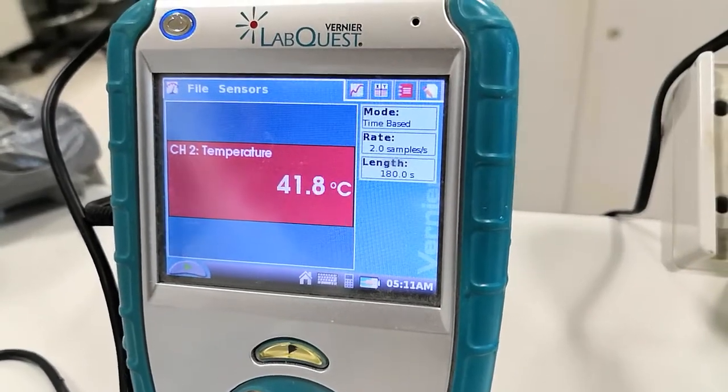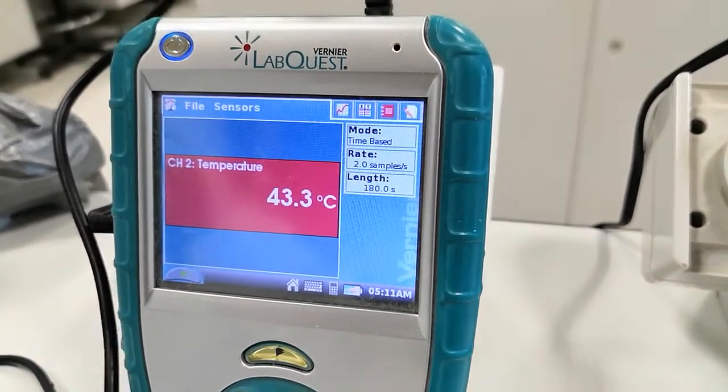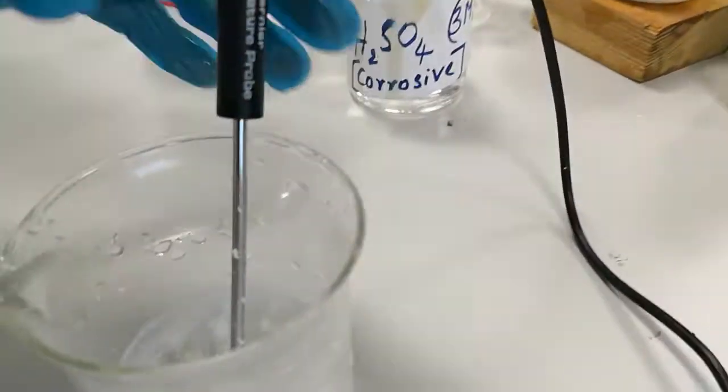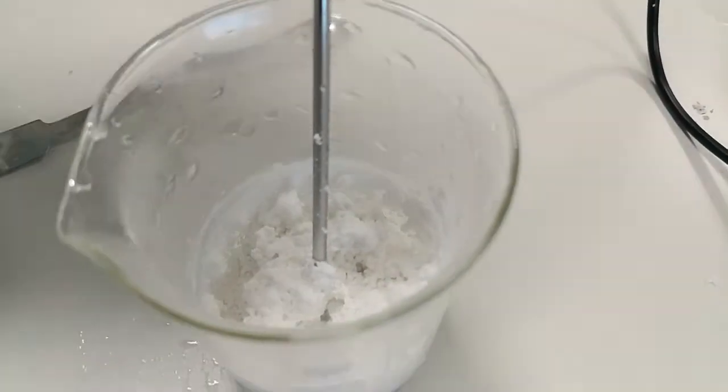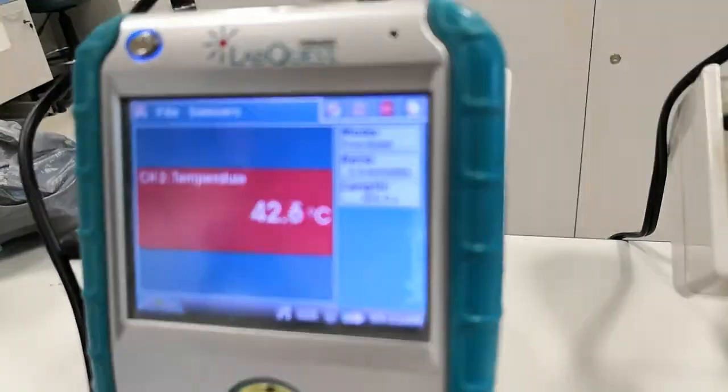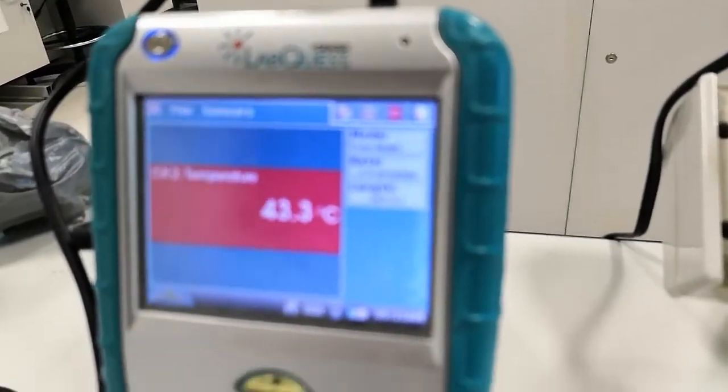We remember we started at 22 degrees Celsius. So this is another example to demonstrate an exothermic reaction.